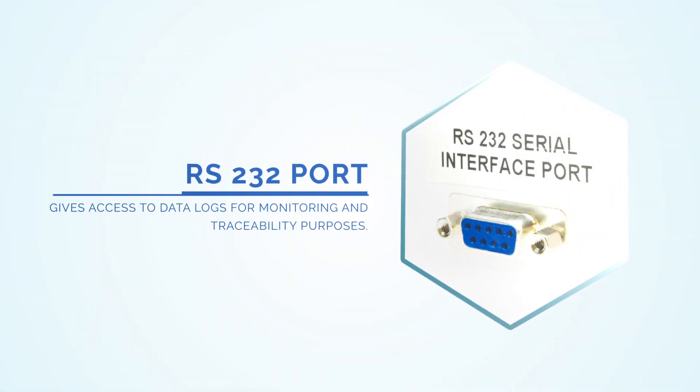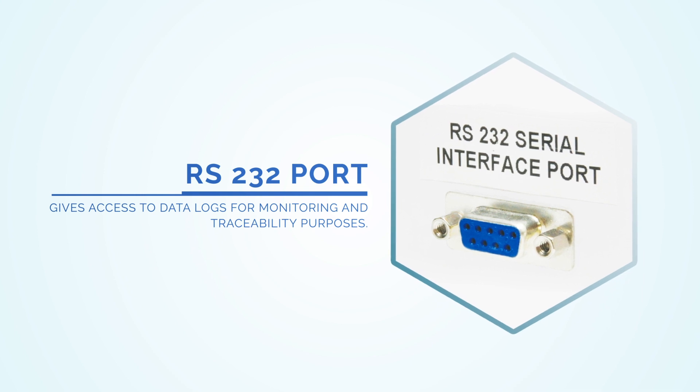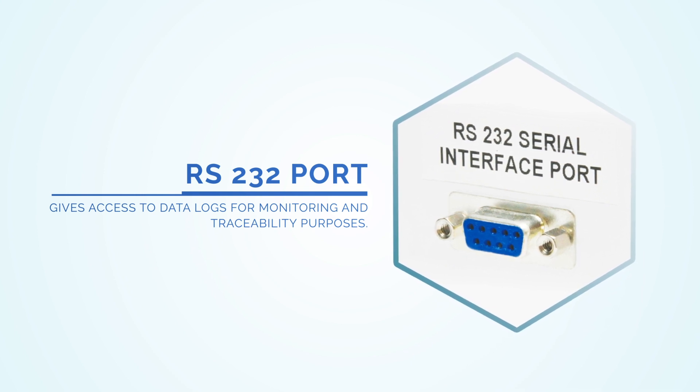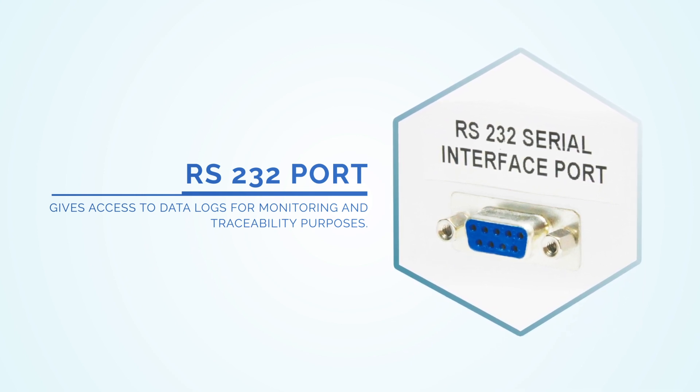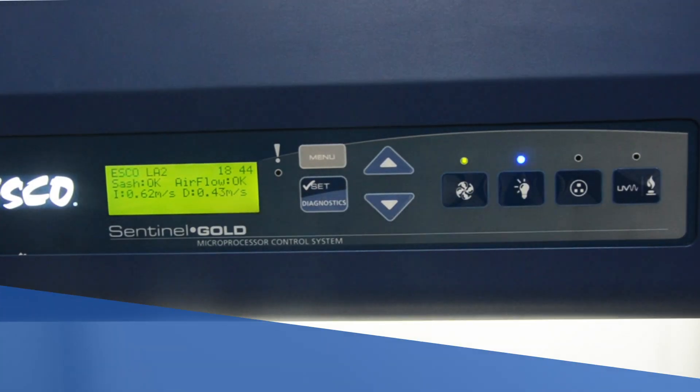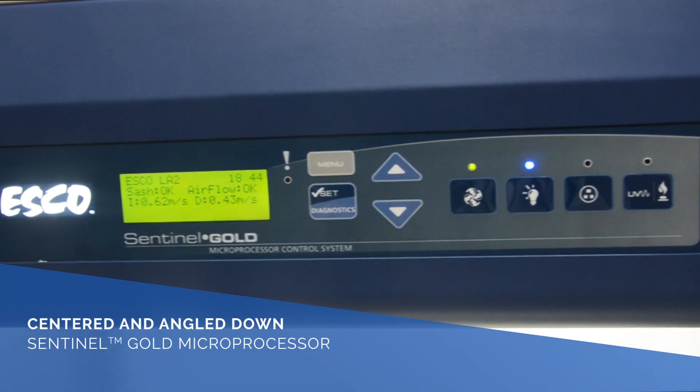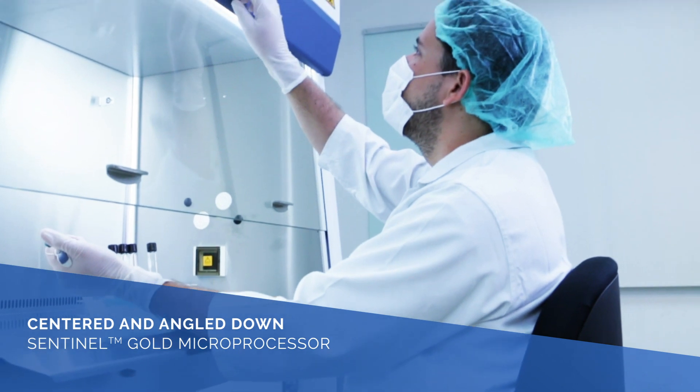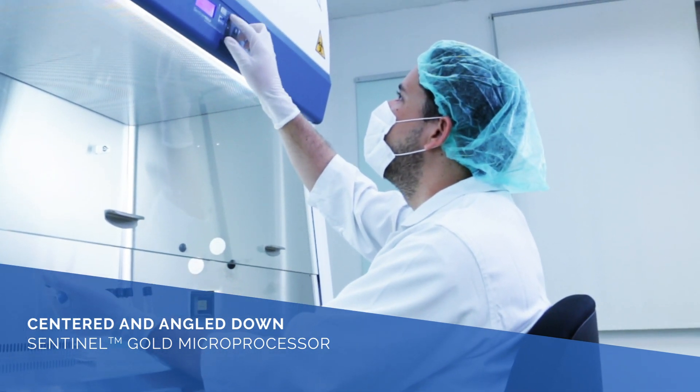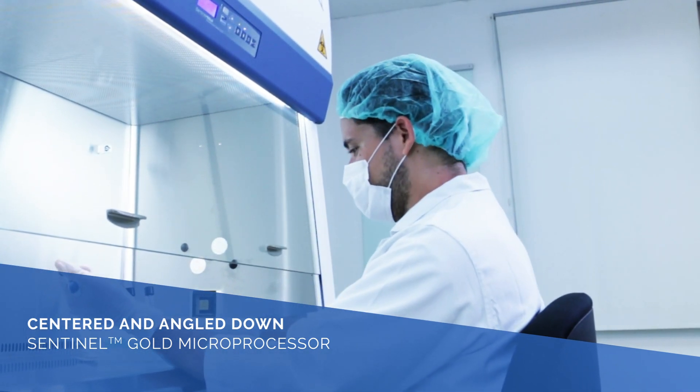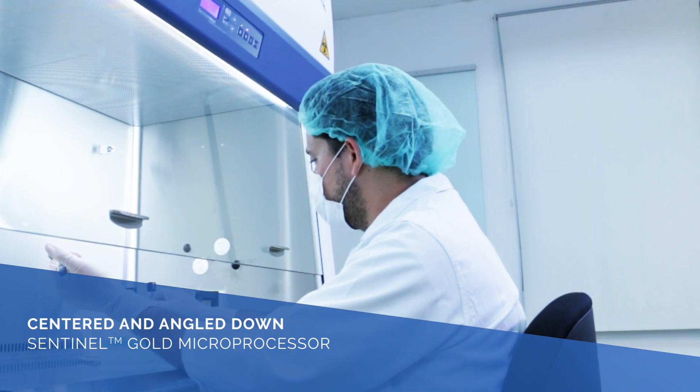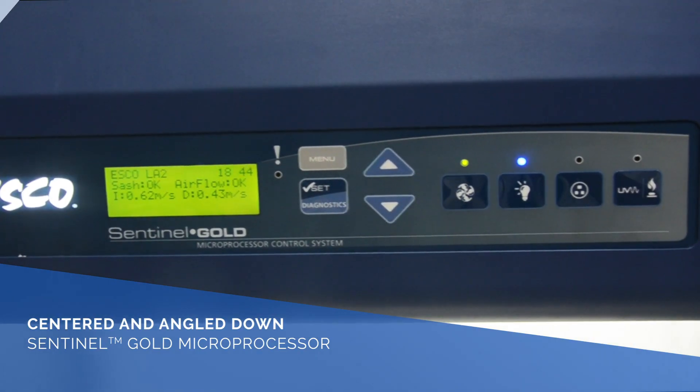Get access to the data logs from the cabinet straight to your PC via RS-232 port for monitoring and traceability purposes. Maximize productivity with the ergonomic features that include centrally located Sentinel Gold microprocessor controller for easy reach and angled down design for easy viewing.